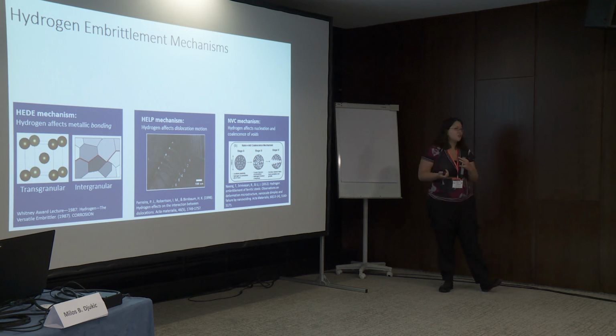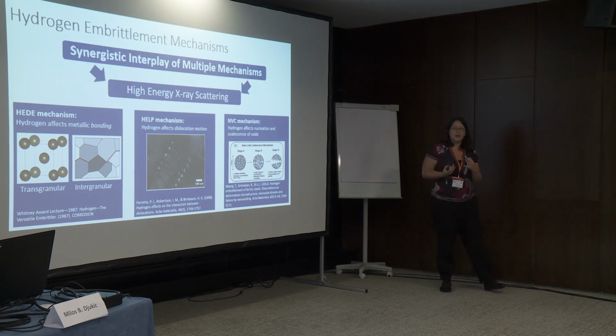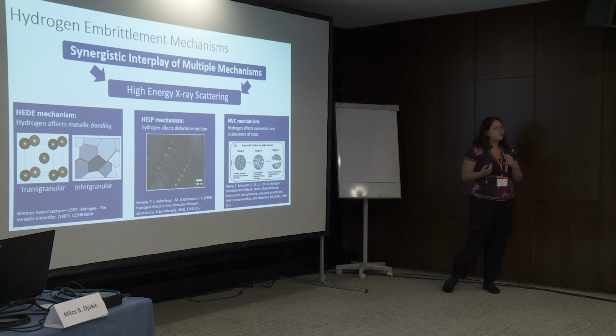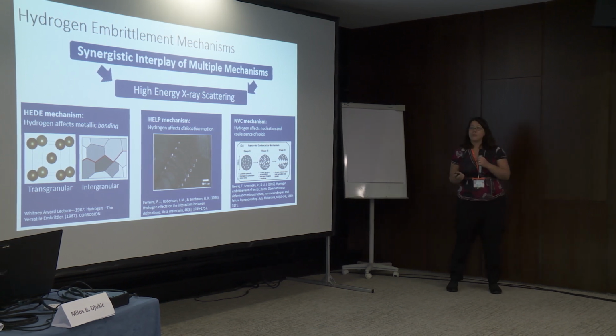So in the last 10 years or so, we started changing our viewpoint a little bit, finally, and going, okay, maybe these are working in conjunction. Maybe we have a bit more synergy going on, that they're interacting. And so we want to have ways to look at all of these simultaneously, and one mechanism to do that is by using high energy X-ray scattering.